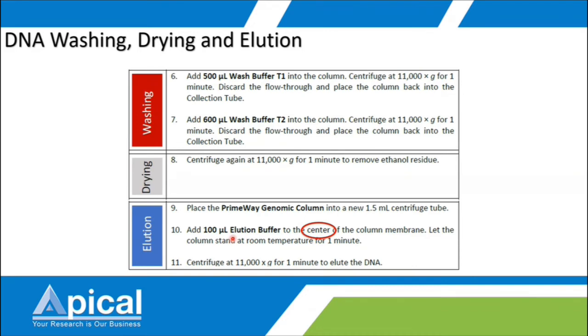The eluted concentration may be increased, but the recovery rate will be lower.